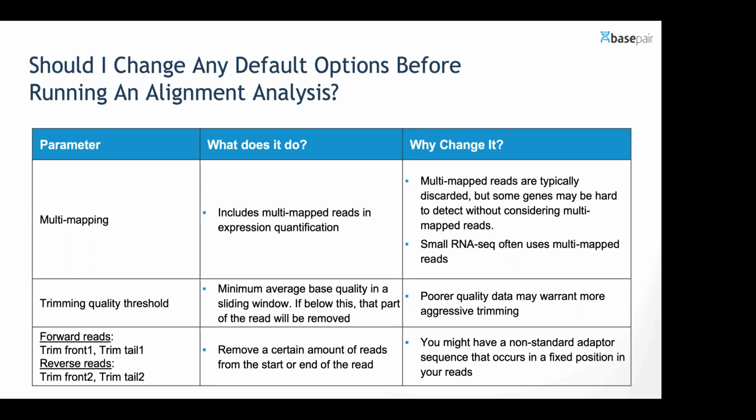That is, you have a read that can map to multiple genes with a kind of equal quality score. And it's unclear from which gene this read originally came. That can impact downstream analyses because, in terms of quantification, you don't want to count reads that didn't come from the gene. So by default, in the RNA-Seq pipeline, we discard those multi-mapped reads.